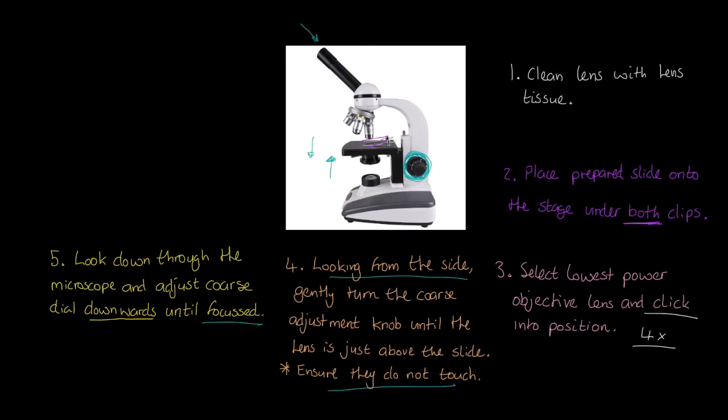Next, we're now going to start using the fine adjustment knob. What we're going to do is we're just going to tweak and play with that until we get the best image, the sharpest image that we can find. If need be, we're going to recenter the prepared slide or adjust it so it's in the correct position to get that best image.